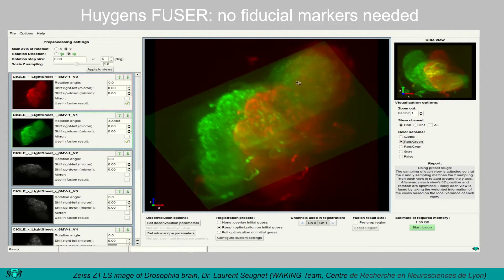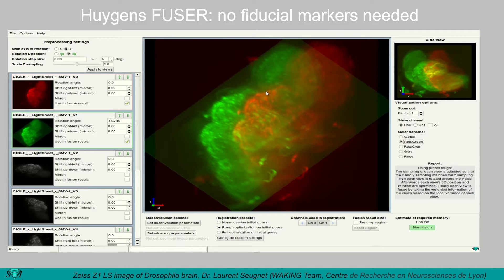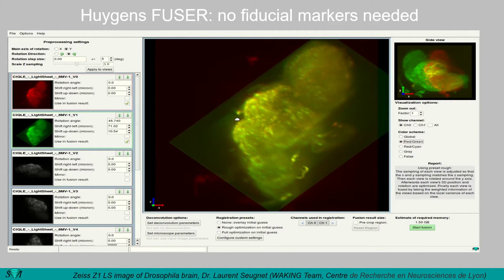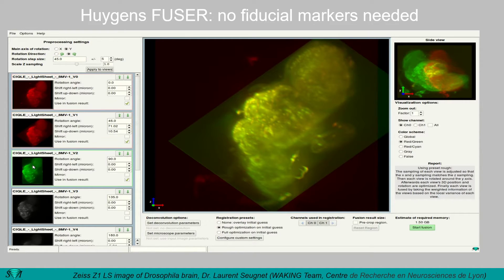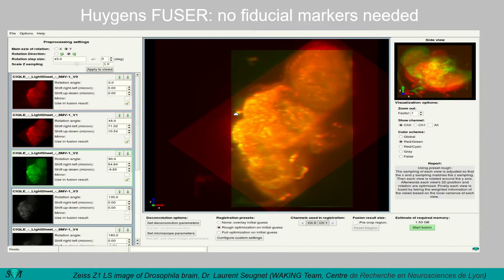This animation demonstrates how the interactive alignment works. The dataset consists of eight views of a drosophila brain, rotated every 45 degrees. Different colors represent the different input views, not related to wavelengths in this overlay. The image shown in red is the reference view. The image shown in green can be positioned over the red image with the mouse. When they align correctly, the combined image becomes mostly yellow as expected. In this way, the views can be added and aligned one by one.